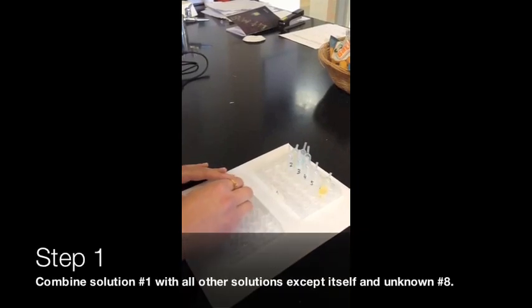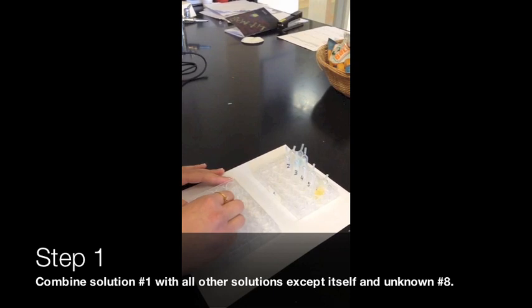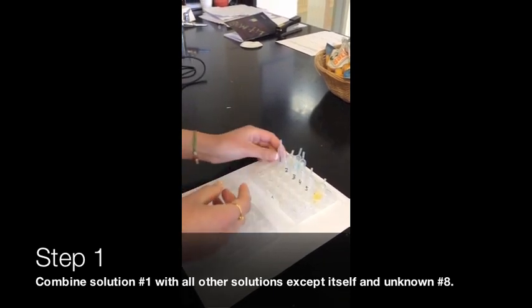The first thing we noticed about the solutions was that 2 were blue, meaning they contained copper ions. We chose solution 1 and mixed it with the remaining non-copper solutions.